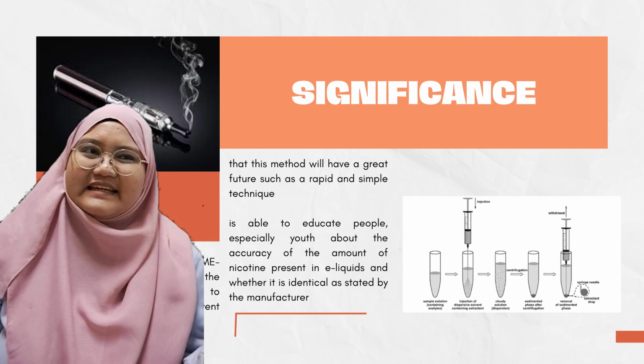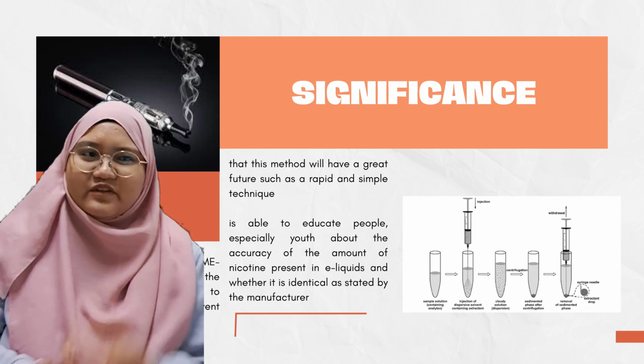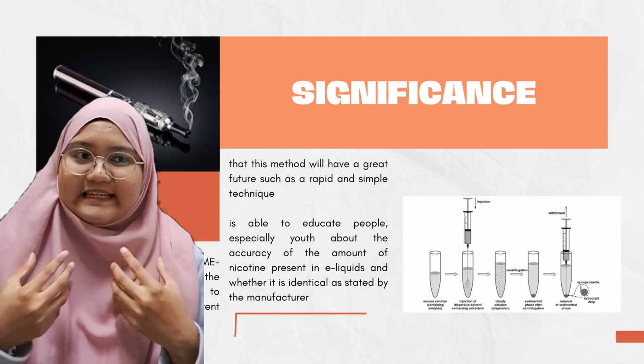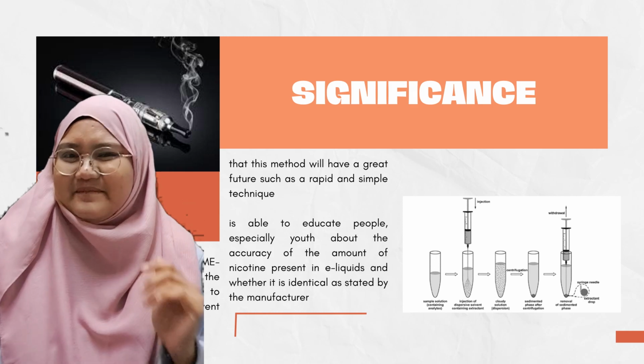And lastly, you are able to educate people about the accuracy of the amount of nicotine present in e-liquids and whether it is identical to what is stated by the manufacturer.